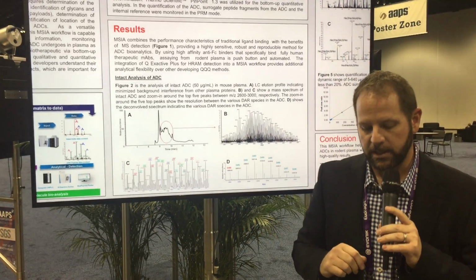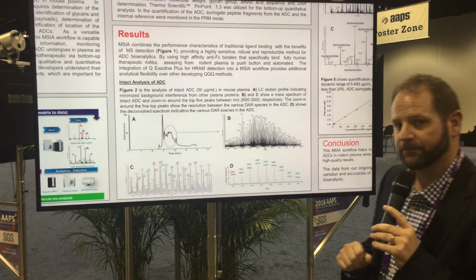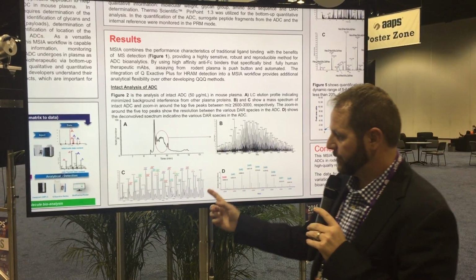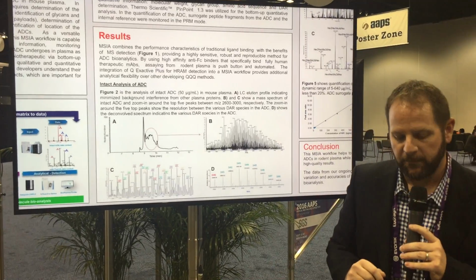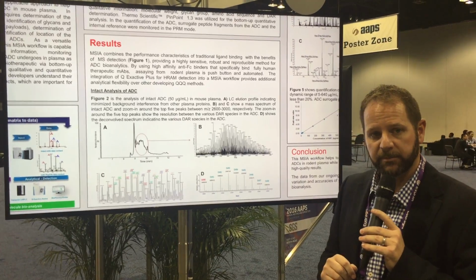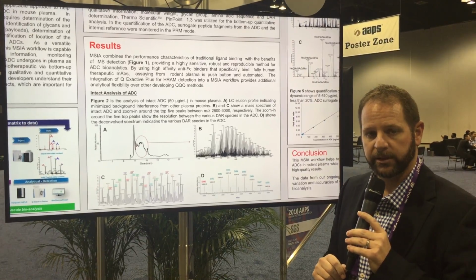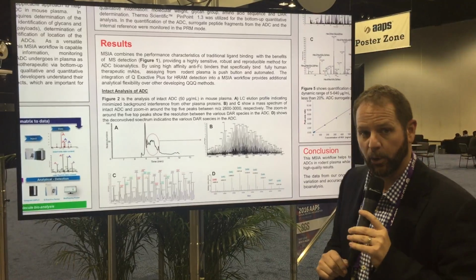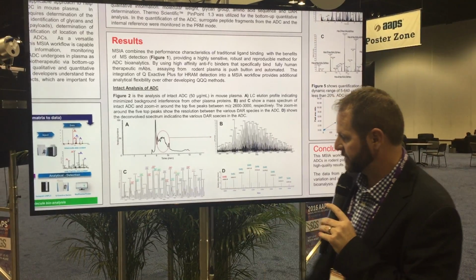And you see with the Q Exactive Plus series of instruments, we can actually get the resolution of each one of these. Very good instrument. We're actually only using the lower end of the resolving power of this instrument at 200 m/z. We're at a resolving power of 70,000, and it actually can go higher. So we can get more resolution on this if we wished.